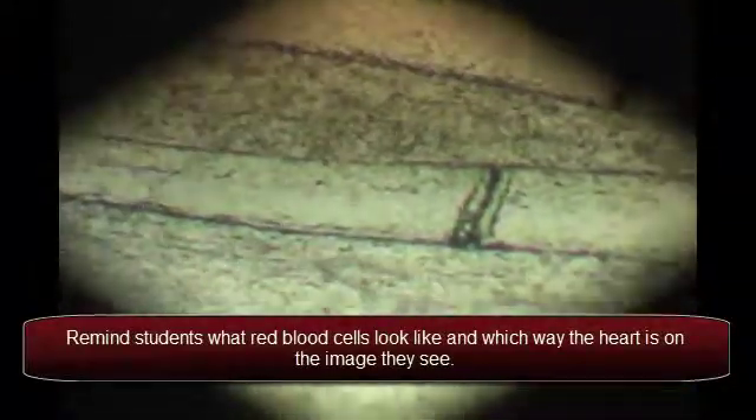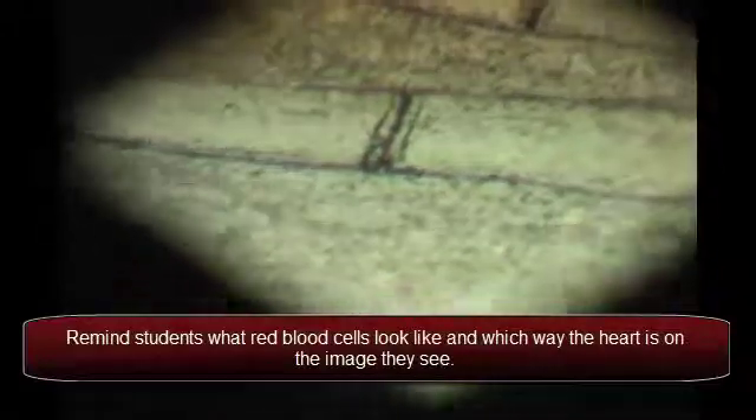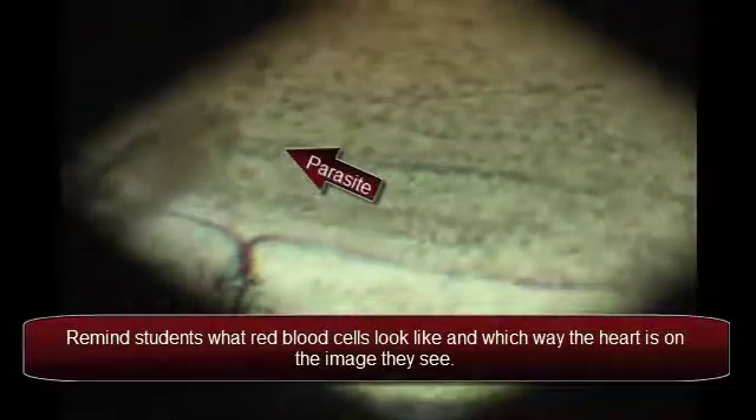we need to keep a few things in mind. You may think the scales are actually the blood cells, but the blood cells are a lot smaller, really tiny. Another thing to remember is that a microscope flips the image, so what looks like it's going toward the fish's head is actually going toward the tail. Just a few things to keep in mind.